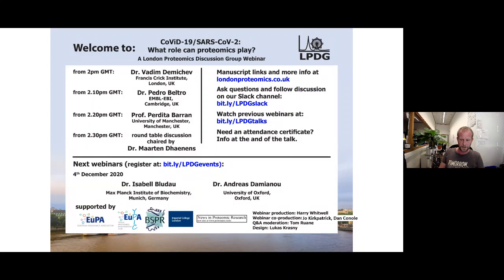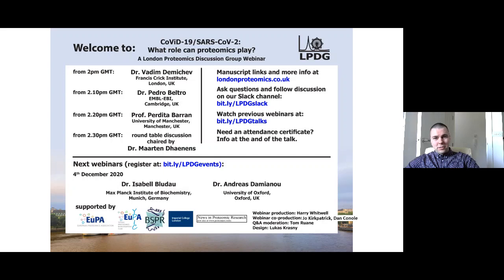Yeah, so we do normalize our data. We don't change anything when we're processing the samples, we just take a plasma sample, and the amount of protein which is in there is the amount which goes into the mass spec. But we do normalize the data in silico when we're processing it. This is quite a sophisticated algorithm, basically similar to what would happen if you took median protein quantities, because different samples have made them the same. So it is normalized. It should correct for these kinds of effects. Not fully, of course, but partially.